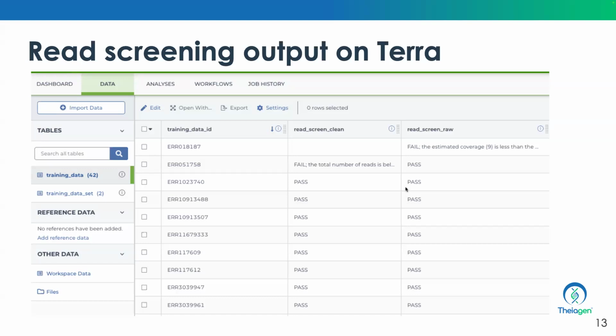So I ran the failures. I got failures again. I did it a second time, a third time, a fourth time, and I quit. So I was wondering, is there a way I could tell why I have a failure? What sort of failure do I have? And like you explained, does it have anything to do with the quality of the reads? Maybe they don't meet the minimum threshold set in TheiaProk. I'm not sure.